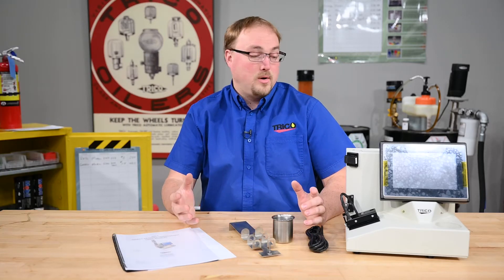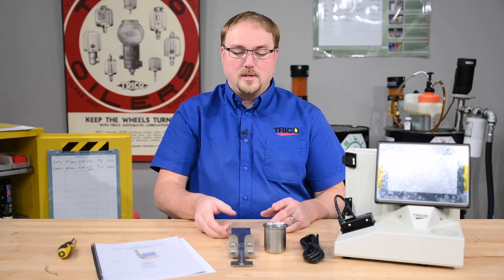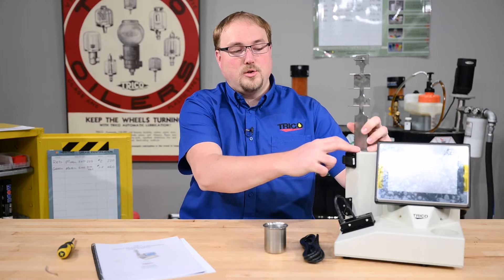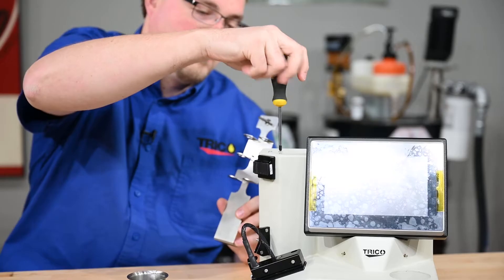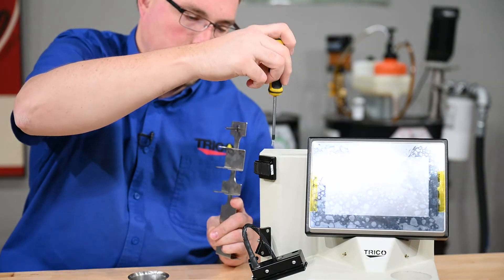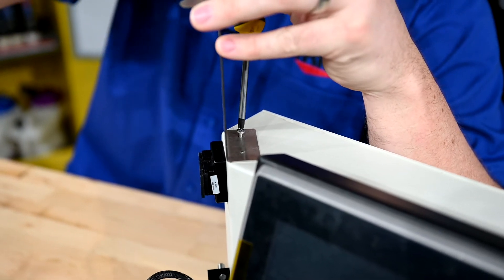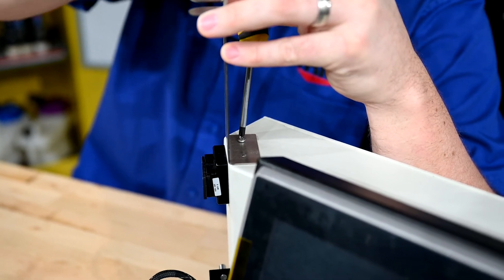Today we're going to talk about how to assemble it and how to use it. The first step for assembly is to take the vial holder and attach it to the top of the unit. There are two Phillips head screws that need to get loosened with the screwdriver. We're then tightening the screws to hold the vial holder in place.